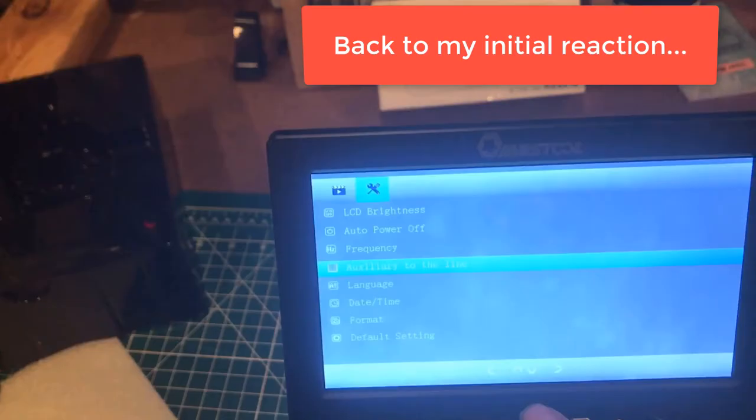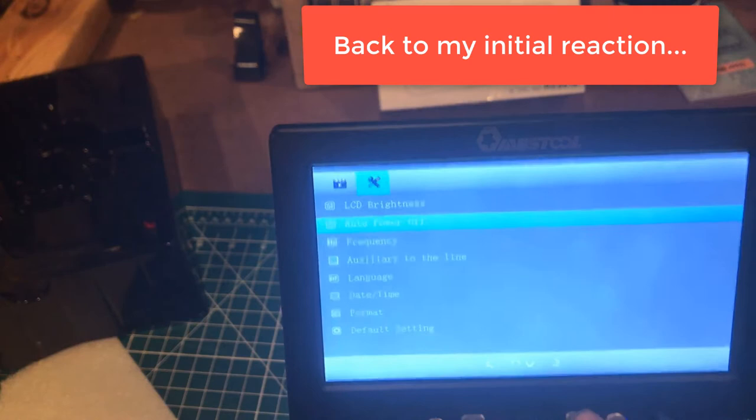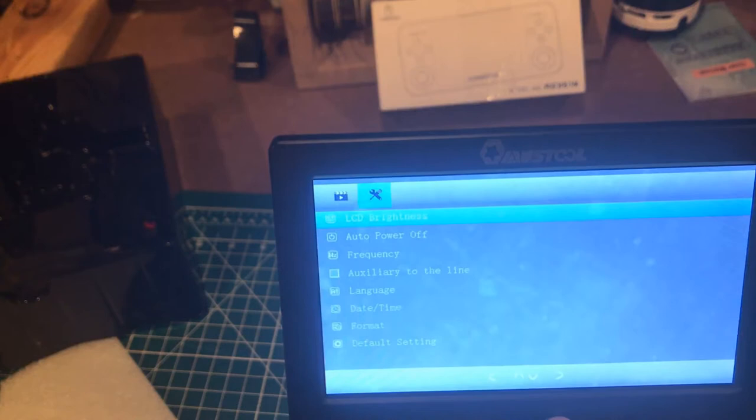This thing is — I mean, it was one of those things that other people had, but I just didn't really believe how good it was. You can even use the menu and still see the thing in the background, which is kind of ridiculous. I've only seen a few items from this Must Tool company, but every single one of them has been impressive.